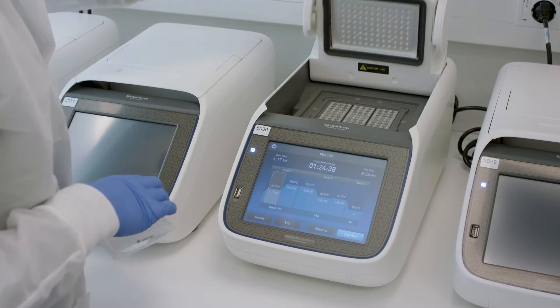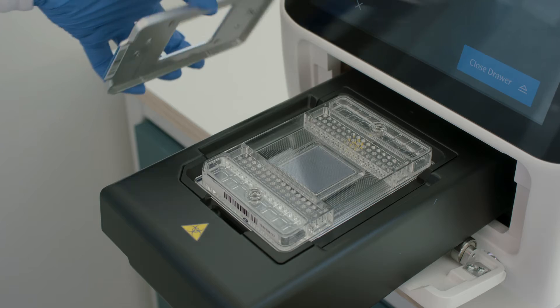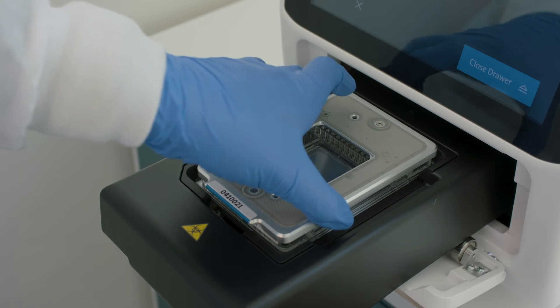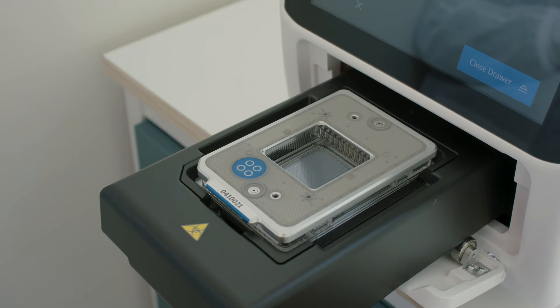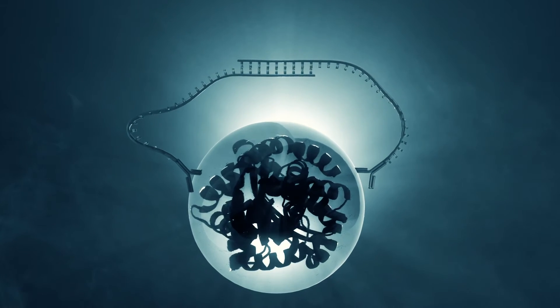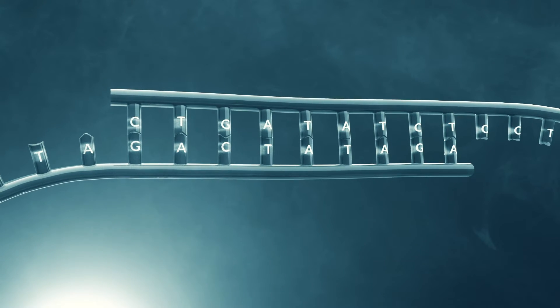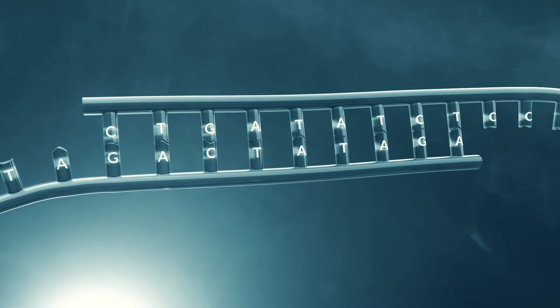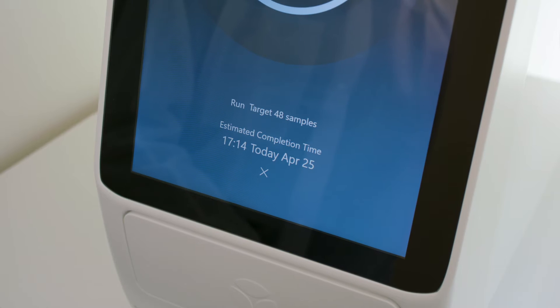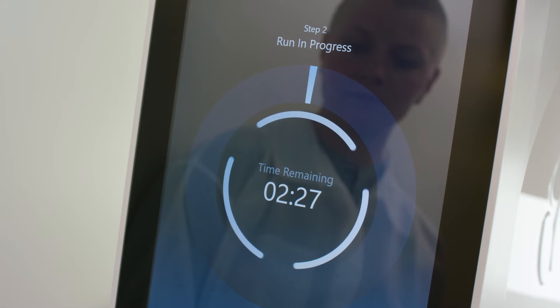The Olink Target and Flex protocols consist of three core steps: the incubation step, the extension and amplification step, and the detection step. The workflow takes place over two days, where on day one, samples undergo an immunoreaction. And on day two, samples are prepared for amplification and detection using QPCR.